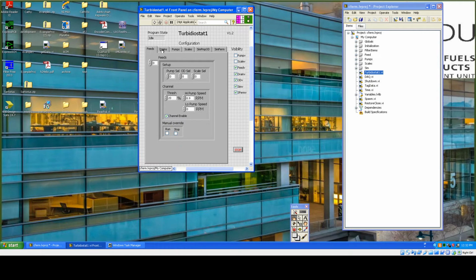Going over a few things very quickly, in LabVIEW you'll notice that these are LabVIEW controls, and this is the initial setup of the VIs that we're going to start. These are all different arrays, and you can index through the array by clicking the up and down arrow in the upper left-hand corner. You'll notice that some entries in the array are clear and others are grayed out. Grayed out ones do not exist, but the ones that are clear are instances that exist.